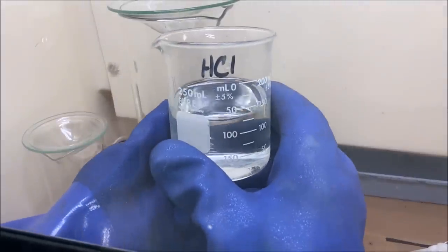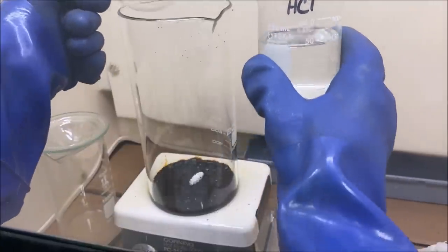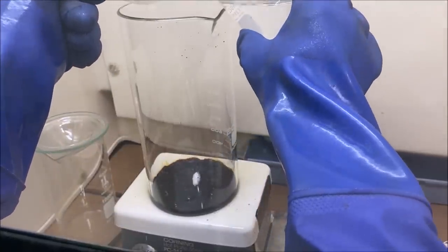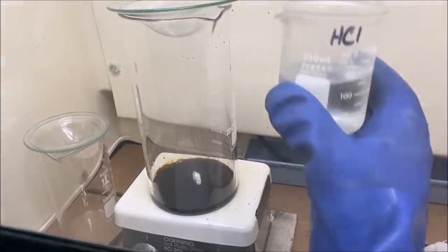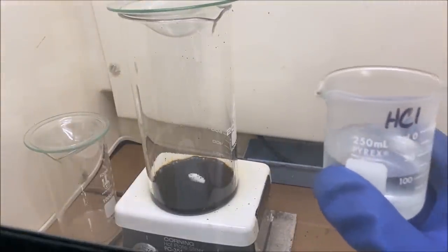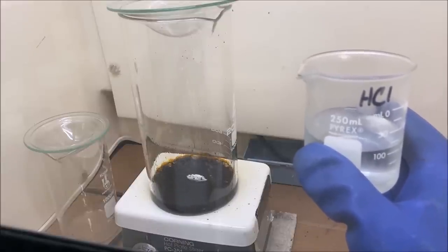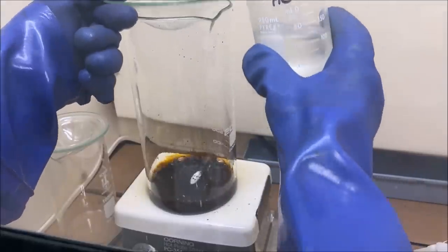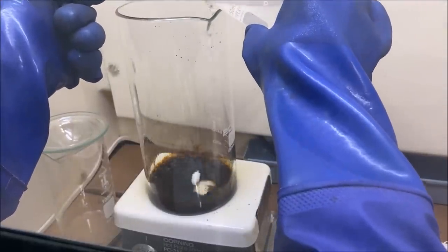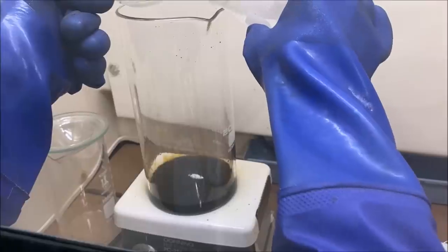I've had this on the heat now for a good 12 hours. You'll notice that it's evaporated down to a syrup. We're gonna add a little hydrochloric and see if we can kick out some nitric acid fumes. And I don't see anything. Normally, if we were expelling excess nitric from that solution, we'd see some brown fume production in there as we add the hydrochloric. And I don't see any.